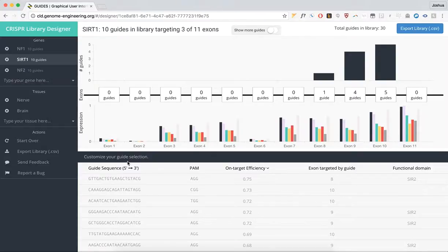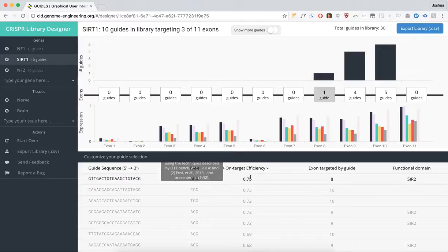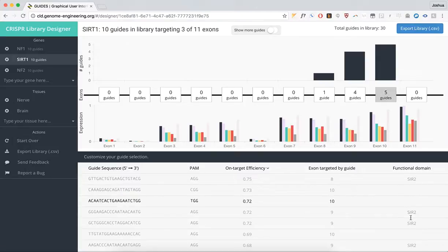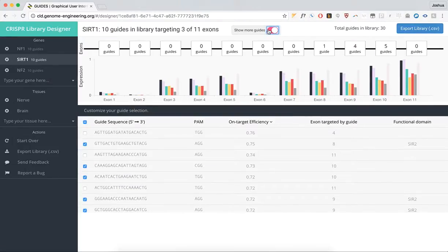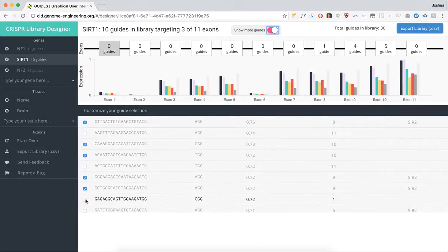You can see your individual guides over here that are being targeted, as well as its on-target efficiency, the exon targeted for each guide, and whether that guide falls within some functional domain. If you'd like to see additional guides, click Show More Guides, and you'll have options to choose more guides over here.